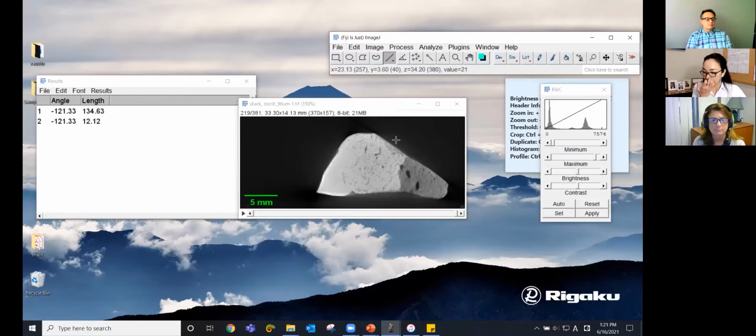And if you're looking for a certain thing you want to do and you can't figure out how to do it, actually Googling it helps. You don't even need a link to a special forum. If you Google, let's say, how to count voxels, ImageJ, that will get you to a page that will explain it. There are so many people who use this tool, and that's the beauty of it.